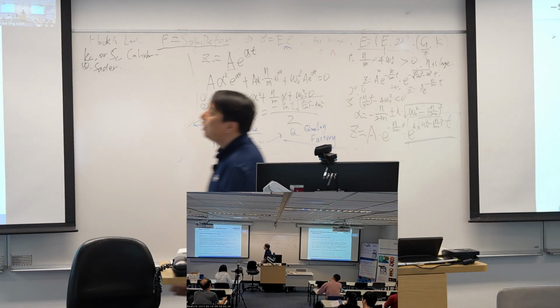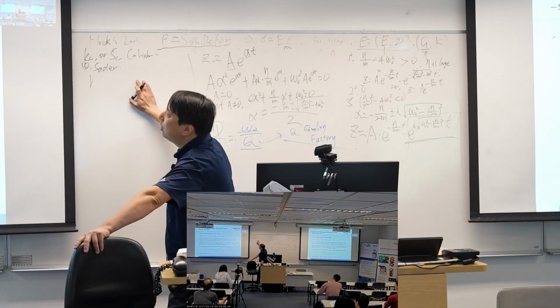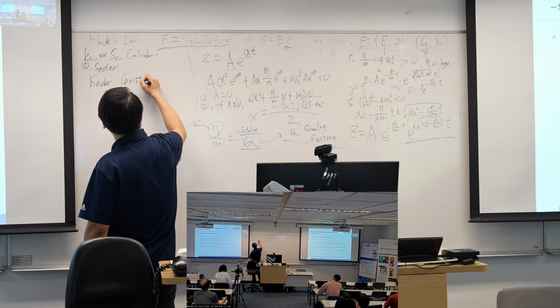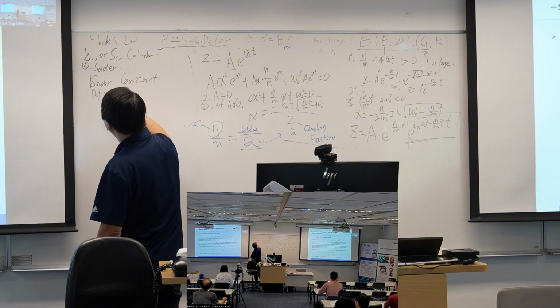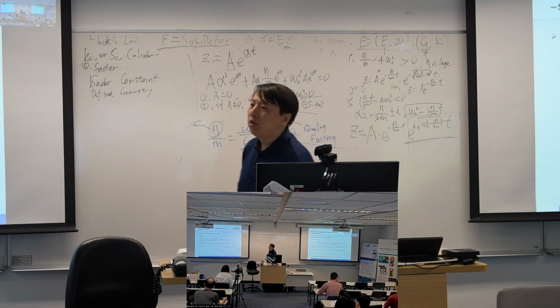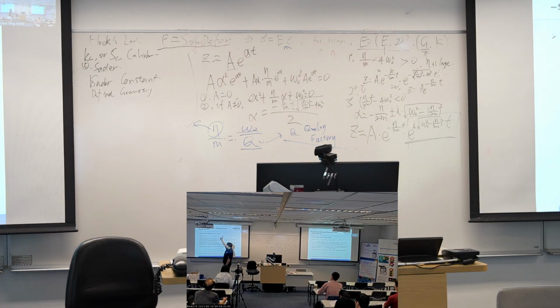As such, he made up a library of his Sader constants, which means if you have a defined geometry, this defined geometry helps to calculate the hydrodynamic force.